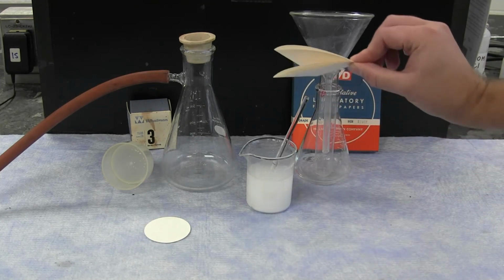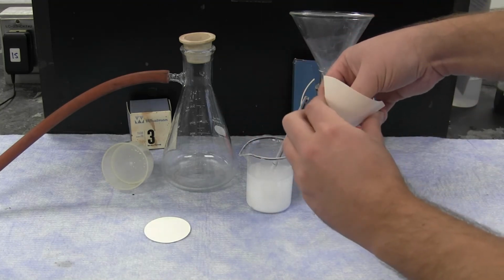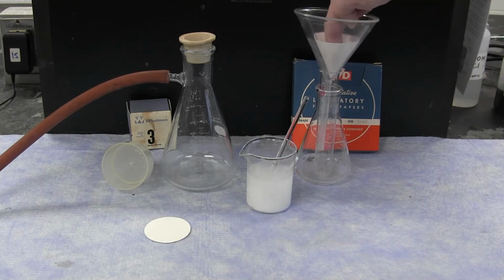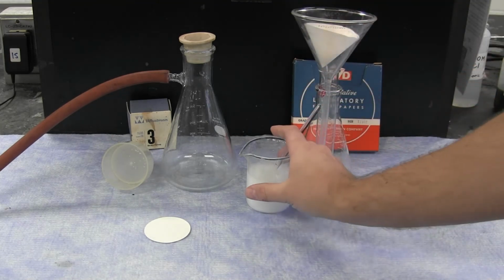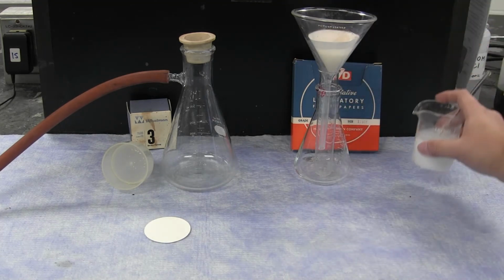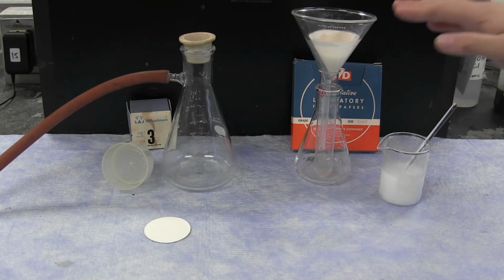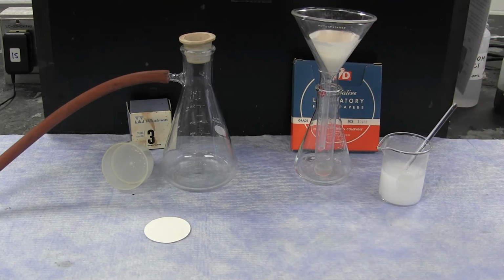What this ends up making is two separate lobes which could be opened up into a paper funnel. This paper funnel is then placed into a regular funnel, and the solution that needs filtration is passed through it. It's called gravity filtration because the only means to draw the liquid through is by gravity. The liquid that passes through the filter paper into the container below is called the filtrate.